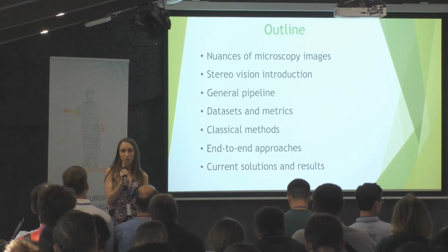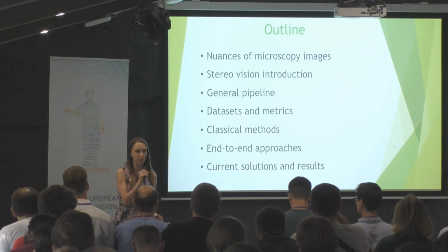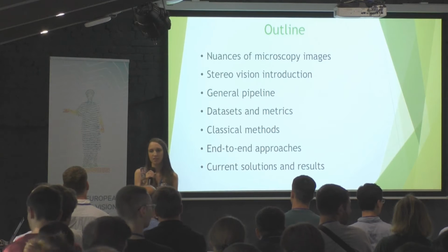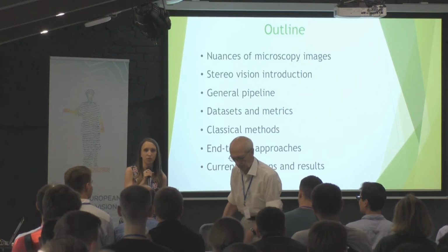What I want to talk about. So I'll talk about some general nuances of microscopy images. I'll talk about some general pipelines for stereo, what is stereo, why we need it. I'll briefly discuss some classical approaches and end-to-end deep learning methods. And then I'll present our solution currently we're using.